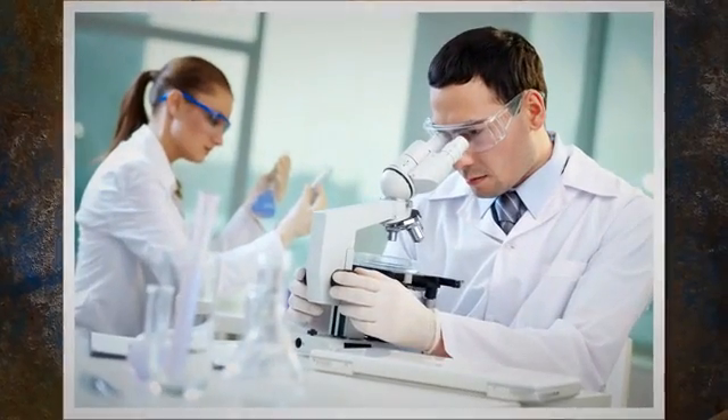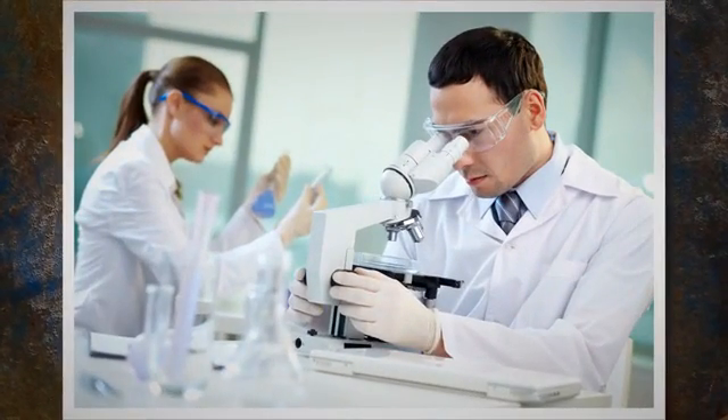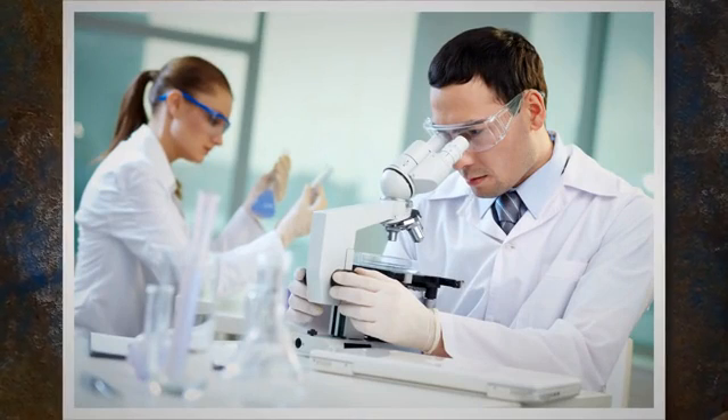The copper sulfate test is a chemical test carried out to find the presence of iron (Fe) in stainless steel by visual verification.